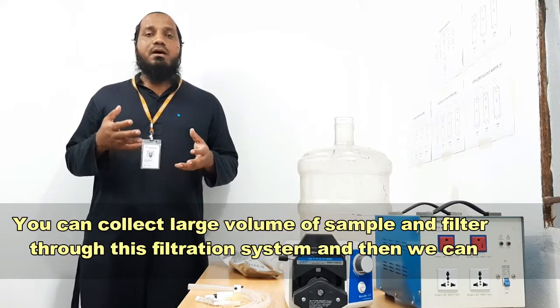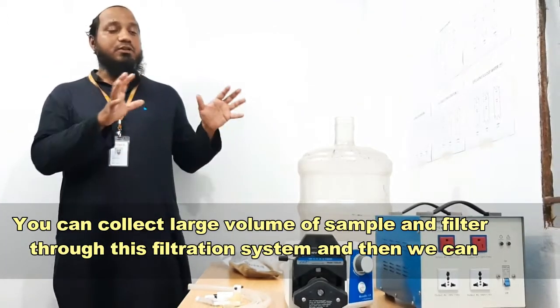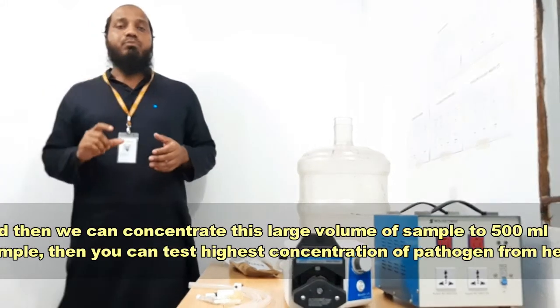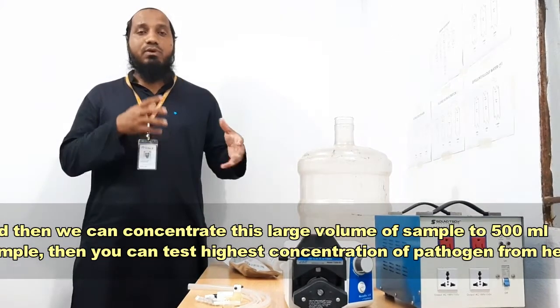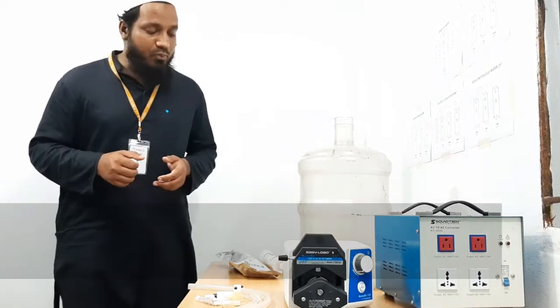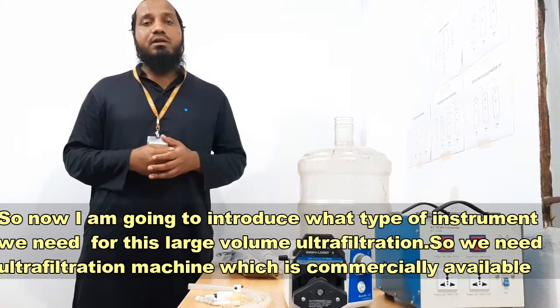You can collect a large pool of samples and filter them through this filtration system, which is called ultrafiltration. We can concentrate this large pool of samples into about 500 ml, and then you can test the highest concentration of pathogen from there. Now I am going to introduce you to what type of instruments you need for this large pooling ultrafiltration.